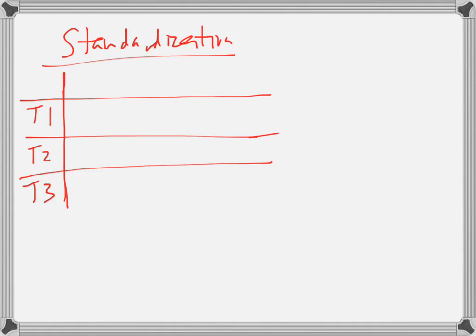Final what minus initial what? I don't know what that means. So your standardization. Okay. Volume delivered. So we've got a volume of EDTA, okay, that you added from your burette. As far as what I want to see in your result is just the number. I don't want to see the final minus initial. I'll assume that you can figure that out. Okay? So just tell me the volume of EDTA that was added.